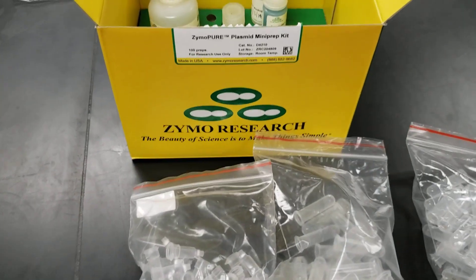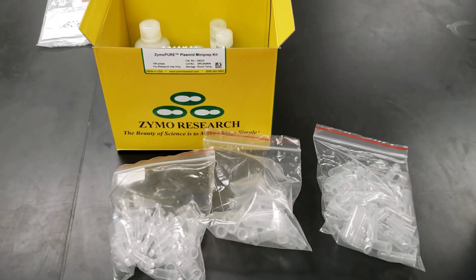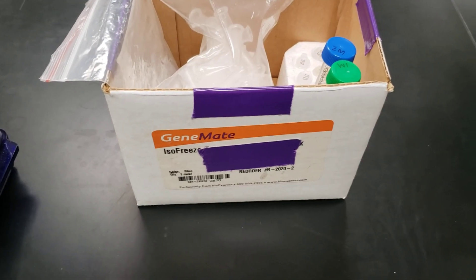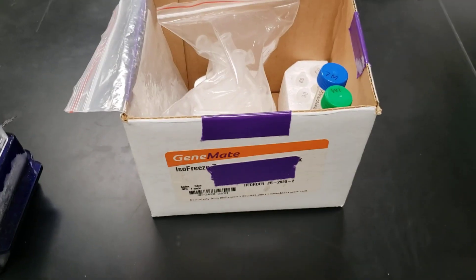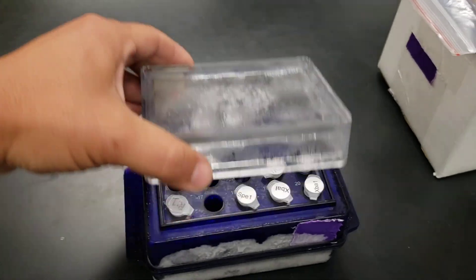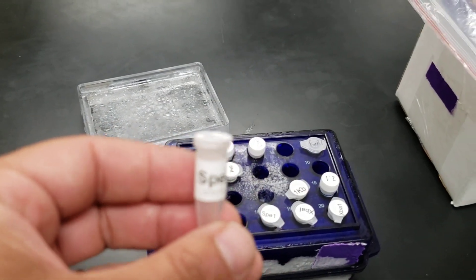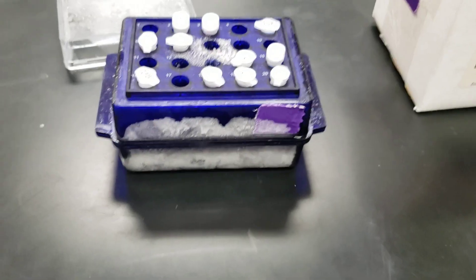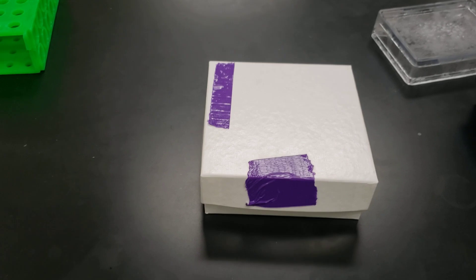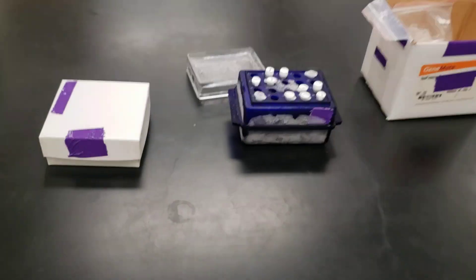I buy bulk material — I really like these plasmid-pure Zymo kits for isolating plasmids. I buy them in bulk, they're relatively cheap that way, and then I break them down into smaller subunits and put them in a box marked with purple. I do the same with enzymes — I buy all our synthetic biology enzymes in bulk, break them into smaller aliquots, label them with my Dymo printer, and put them in a color-coded box. Students are also given a storage box for their plasmids and parts collected throughout the semester.